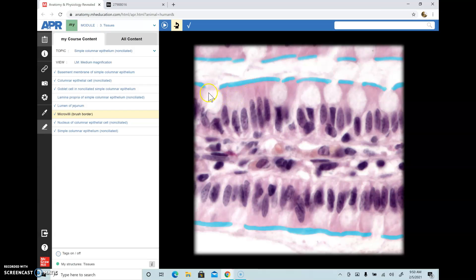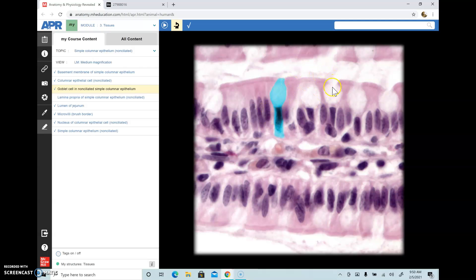A special feature of some columnar epithelial cells is the presence of goblet-like structures known as goblet cells. These hollow structures are the goblet cells, and their mouth is open towards the lumen because they secrete mucus towards the lumen. You find goblet cells in parts of the body where you need a lot of mucus, like the upper respiratory tract and the large intestine.